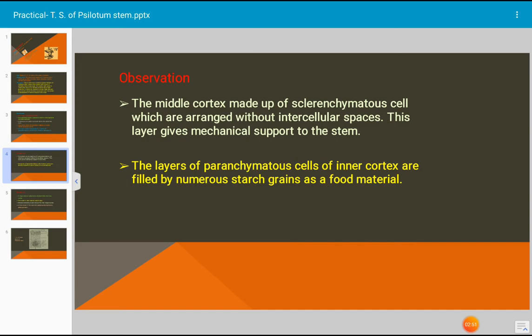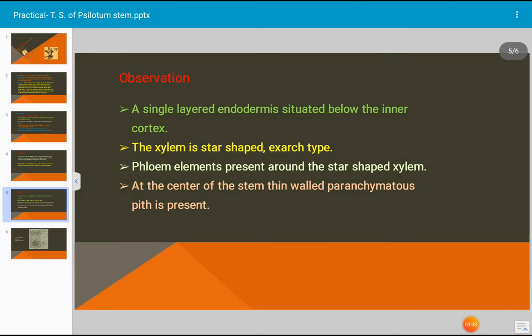This layer gives mechanical support to the stem. The layers of parenchymatous cells of inner cortex are filled by numerous starch grains as a food material. A single layered endodermis is situated below the cortex.